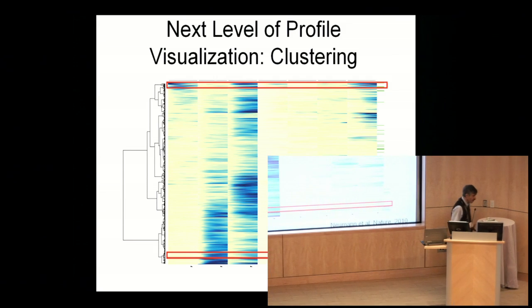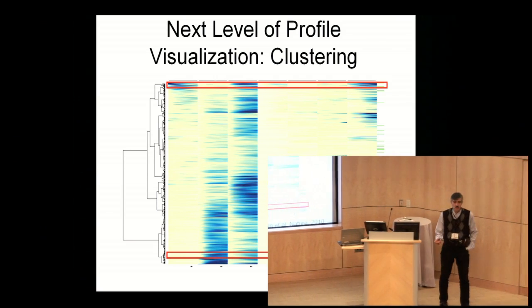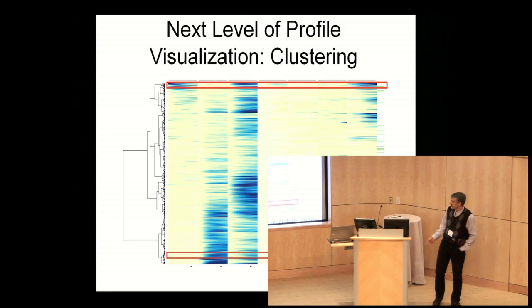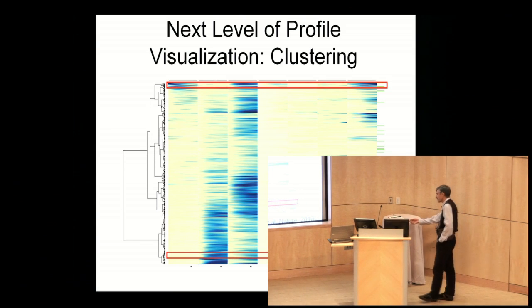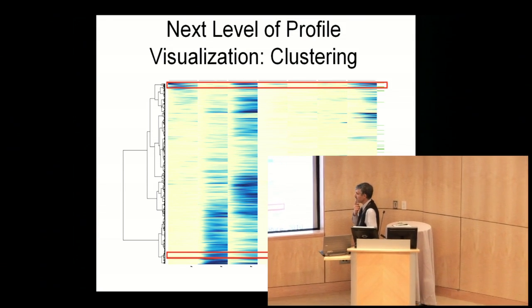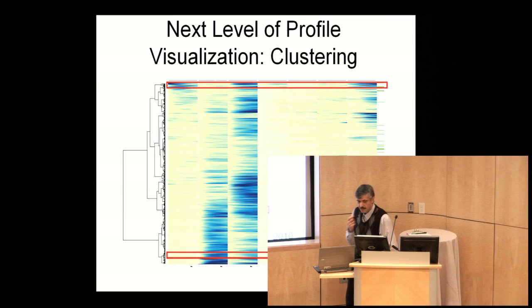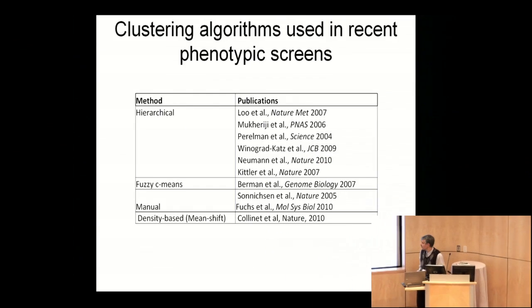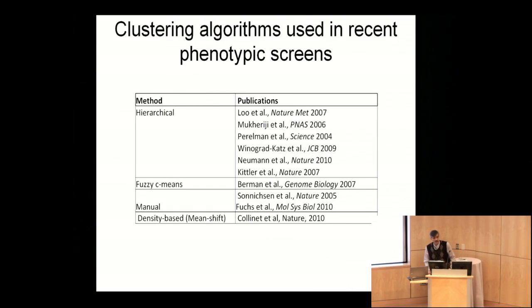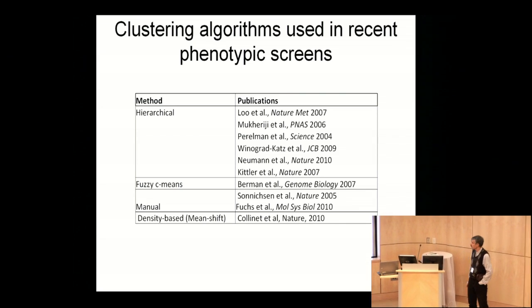So the next way you can combine this: you say, okay, I don't want to see individual profiles, I want to cluster them into groups. And this is another presentation of the clustering we saw today in multiple talks. And then we think about presentation, but not so much about how we cluster. But in reality, if you look at the field of screening, in the latest publications, you see that people use very few clustering tools.